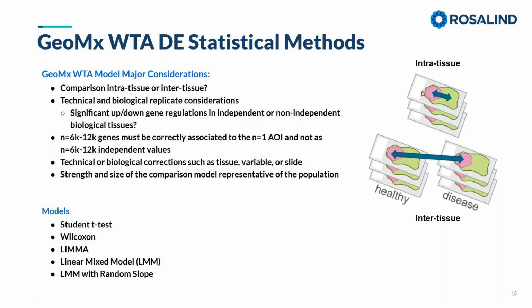They're non-independent. And so if we have upregulation or downregulation of these same genes within the same tissue, and they're assumed to be independent tissues, you're going to have higher significance in your genes. So maybe these tumor genes A, B, and C show a fold change of 20 because it thinks that they're all from different tissues, when instead it should recognize that they all come from the same tissue, and it shouldn't be as strong of an upregulation as what you're showing.